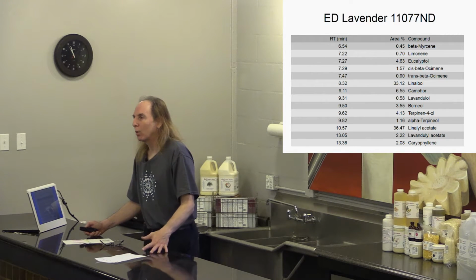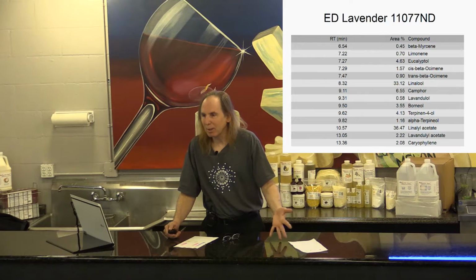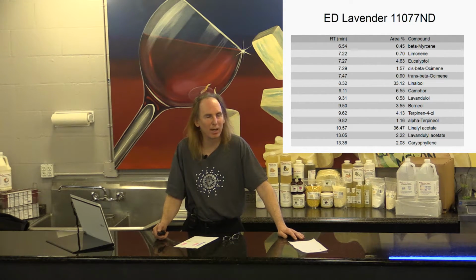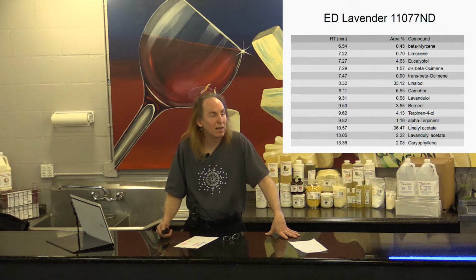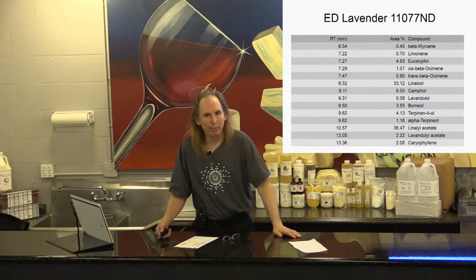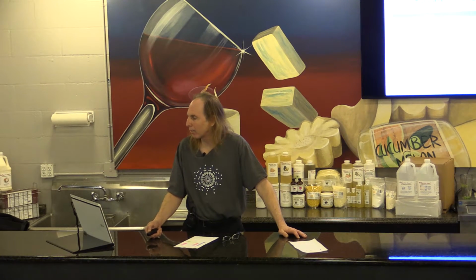So how do you know whether this is a good lavender oil or a bad lavender oil? You have to come back tomorrow, because that's what I'm going to be talking about in tomorrow's lecture. Now that we know about GCMS and what the report means, how do we look at a report and decide, I can't say pure lavender oil, what will we be looking for? An authentic lavender oil, a genuine lavender oil, an unadulterated lavender oil? How do we know whether this is good lavender oil or bad lavender oil?